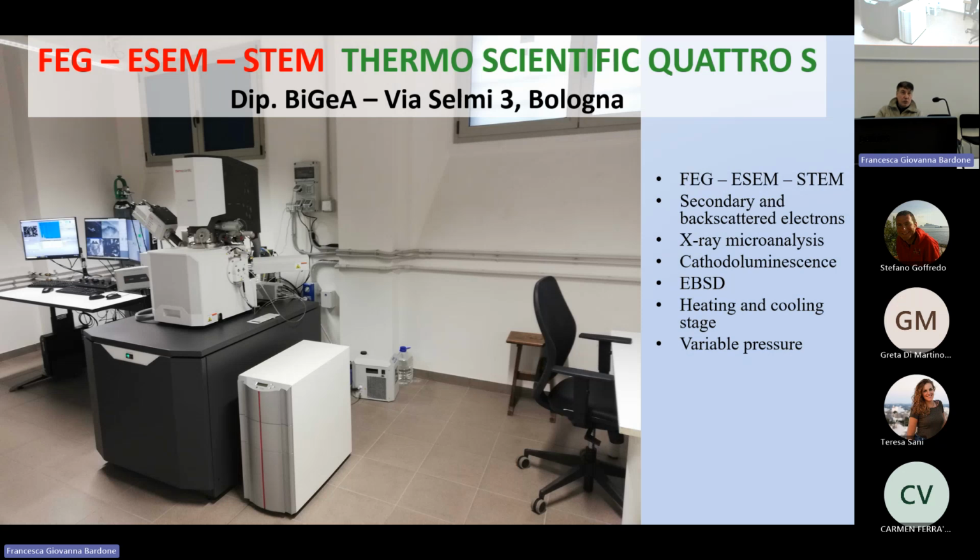So usually, in most classical SEM, you need to cover your surface with a conductive layer. Usually it is gold, but most often it could also be carbon. But you need to cover all the insulating material in a classical SEM to remove the charge. During the observation, you accumulate charge. You don't want the charge. The charge creates damage. You need to cover with a conductive layer.